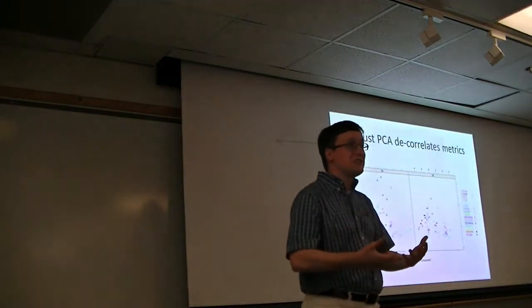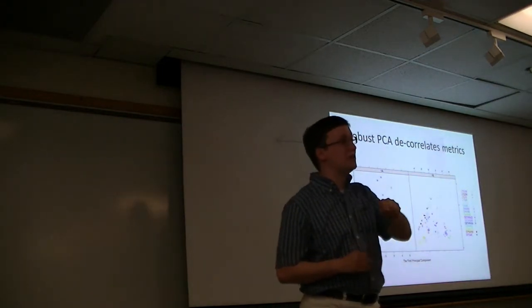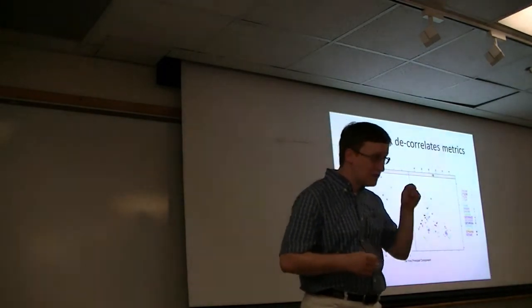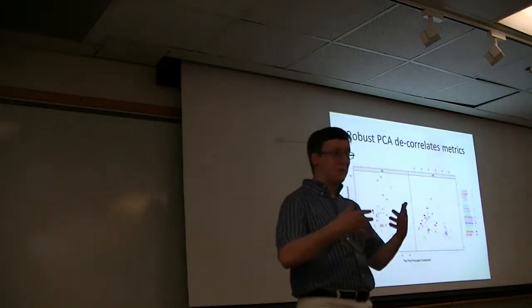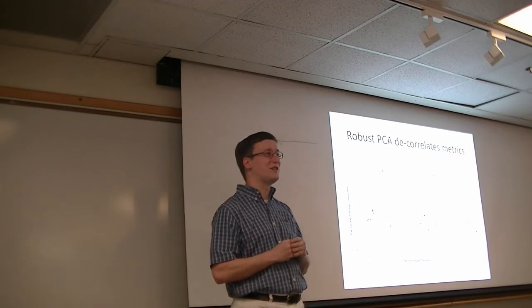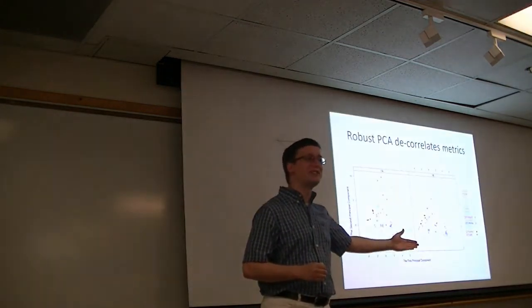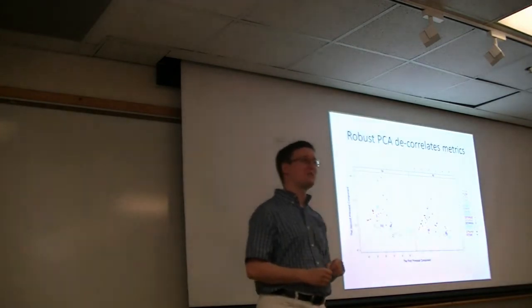Essentially, when we started CPTAC, the National Cancer Institute said, if you said you had an instrument available for our experiments, you must include it in this experiment. So there was a lot of community participation. If we had claimed that the LC MALDI system would participate, well, the LC MALDI showed up in this experiment as well.